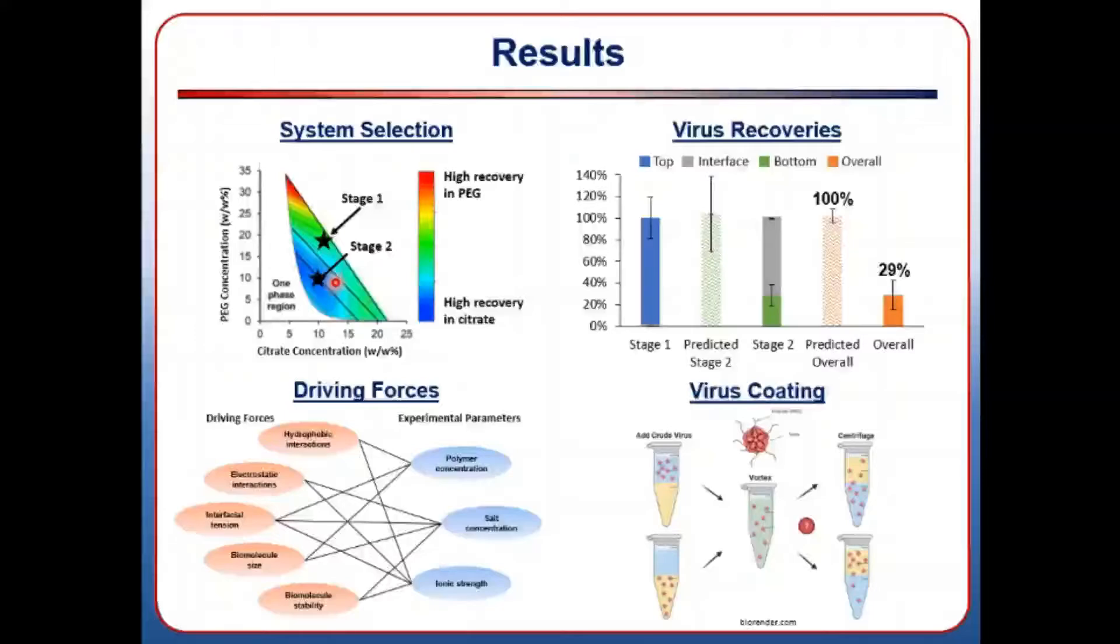In our experiment shown here on the right, the recovery in the first stage worked quite well, but recoveries in the second stage were much lower than expected. This reduced our overall recovery as well. This may be caused by the PEG molecules adhering to the virus during the first stage and strengthening the interaction between the virus and the PEG-rich phase, so we plan to run more experiments where the virus begins in either the PEG or the citrate to test this hypothesis.